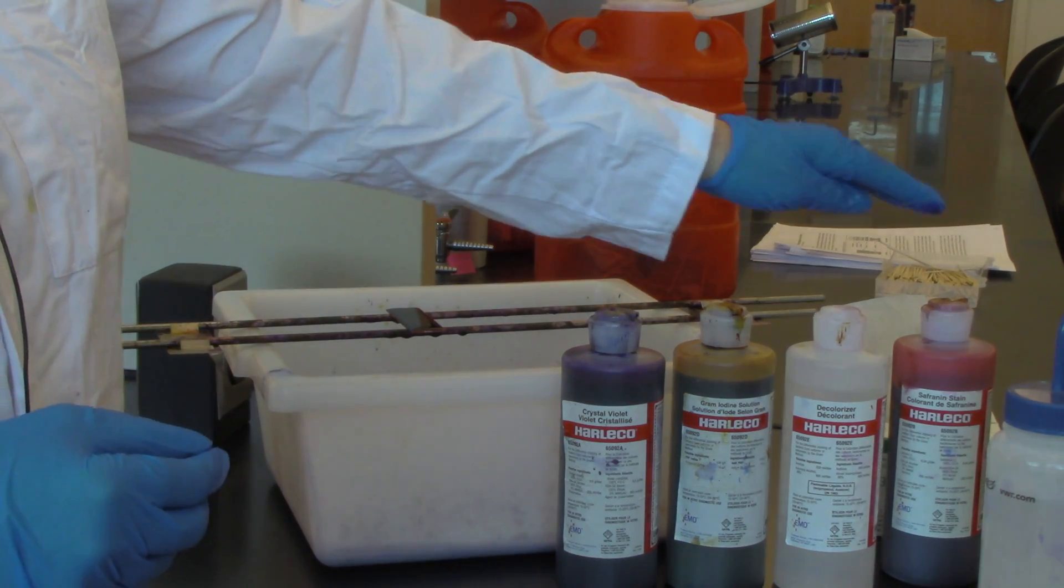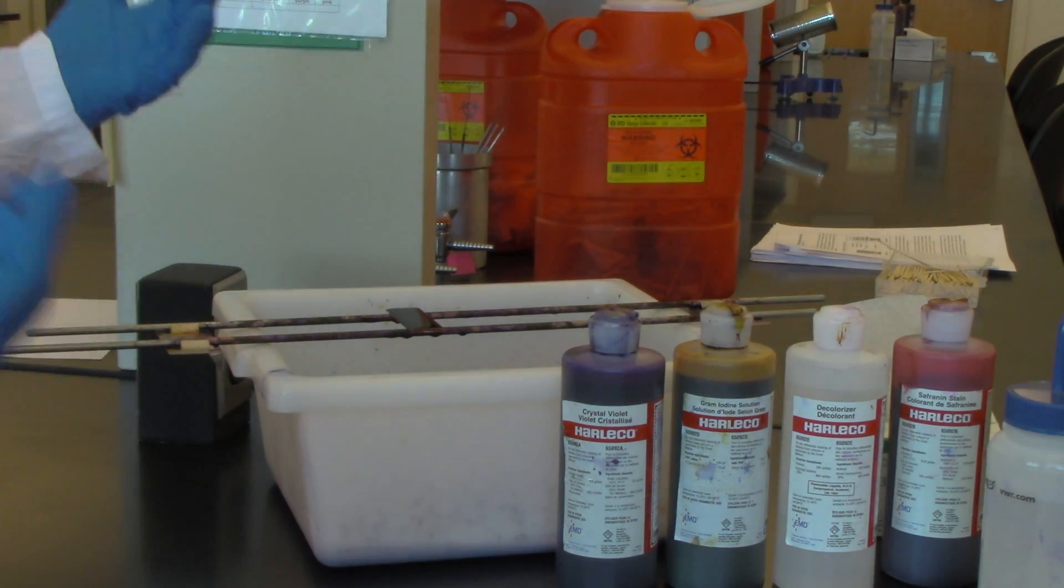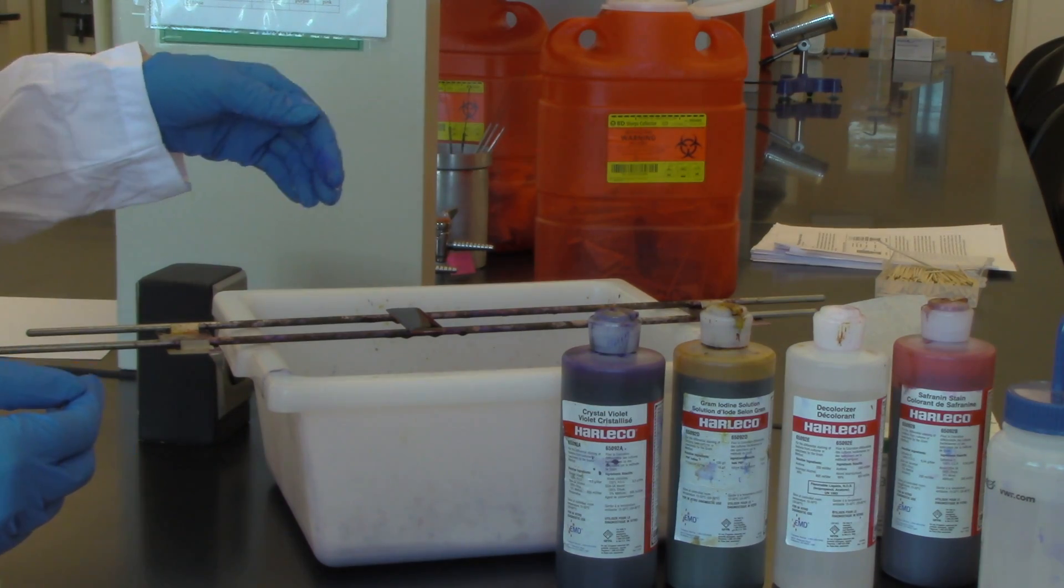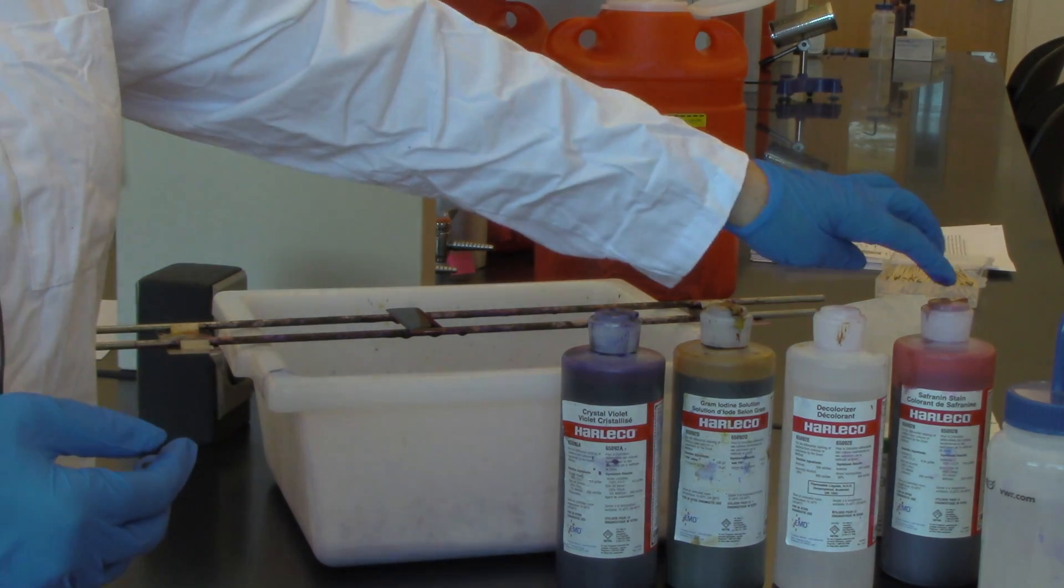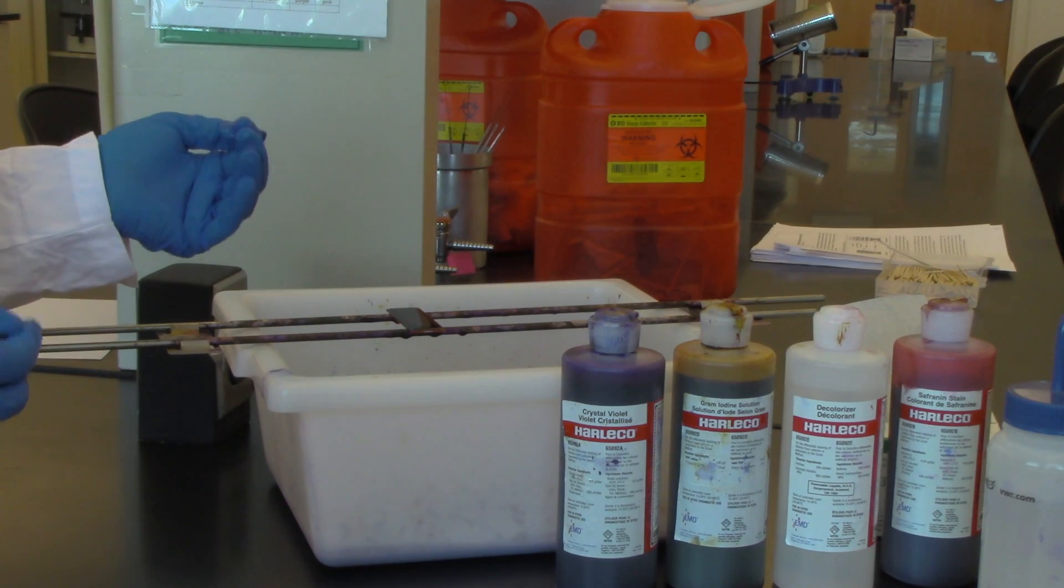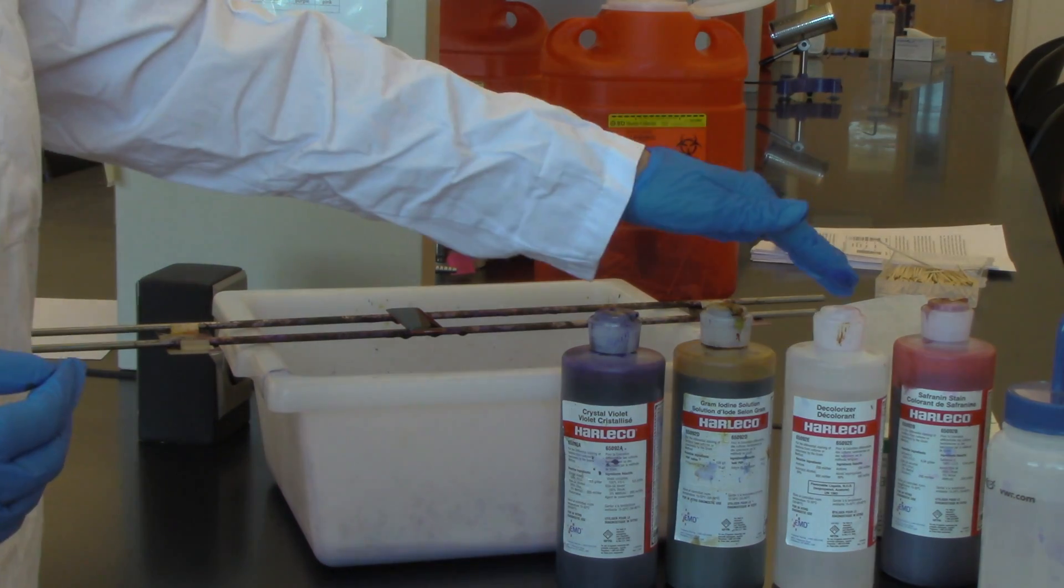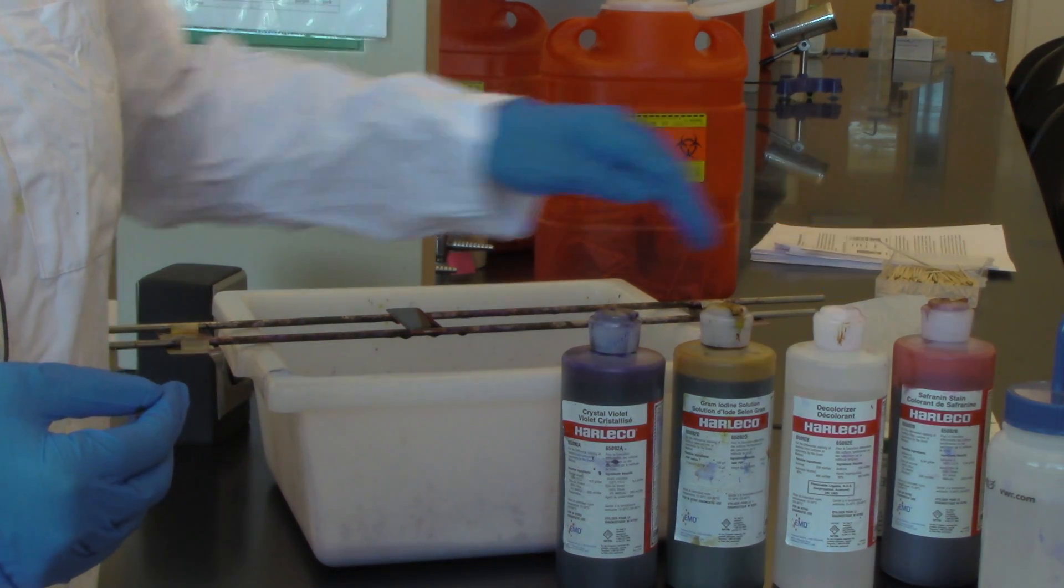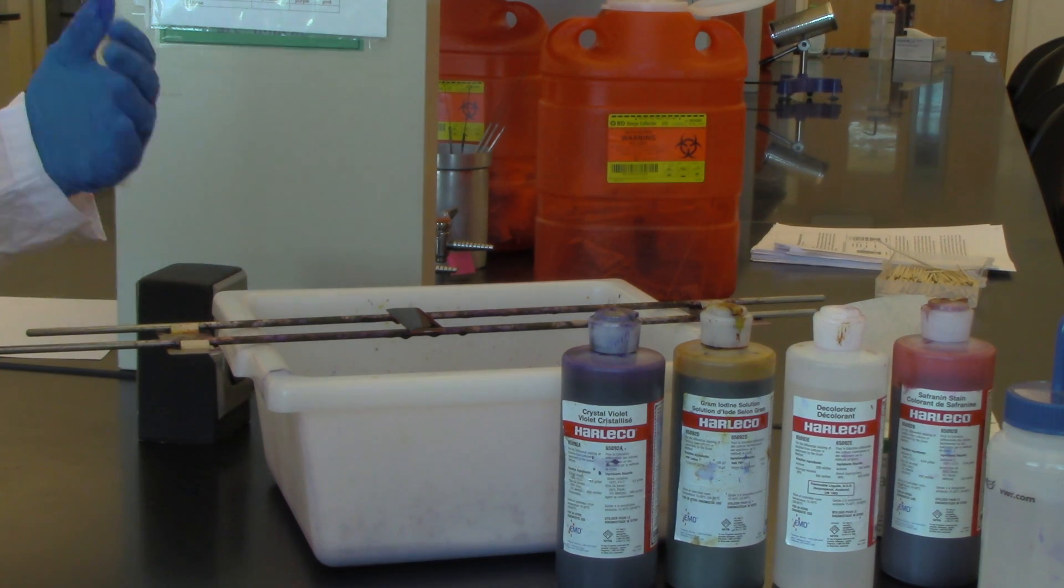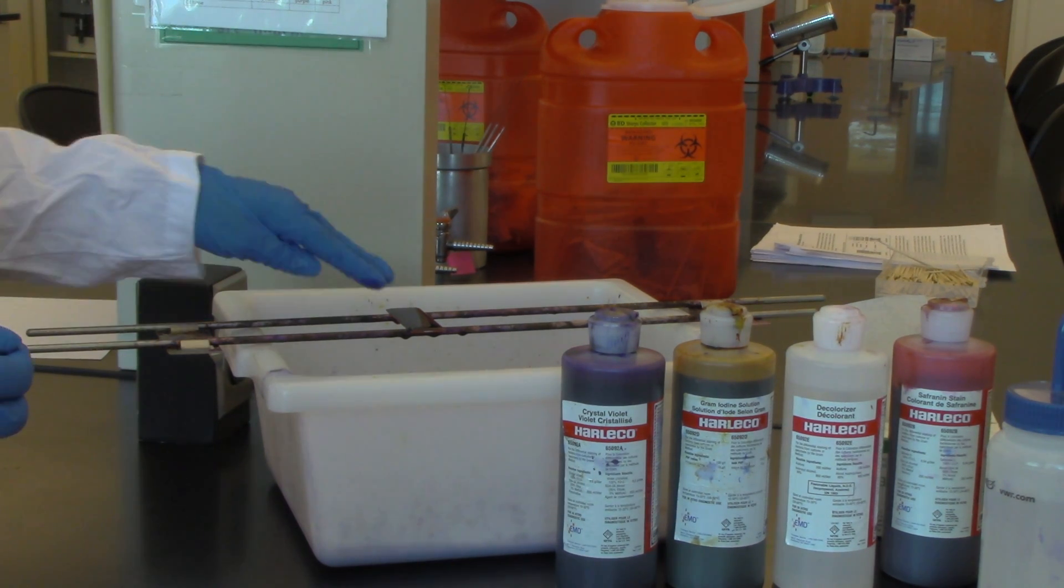So we follow up with the last step anticipating it could possibly be gram-negative or a mixed sample with the safranin. If you were to wash out the stain because it's gram-negative during the decolorizing step, you then would have the safranin which would add some pigment to the cell even if it were gram-negative.